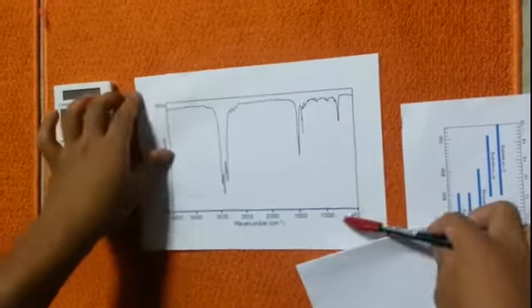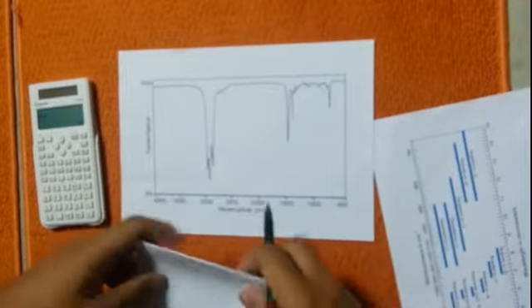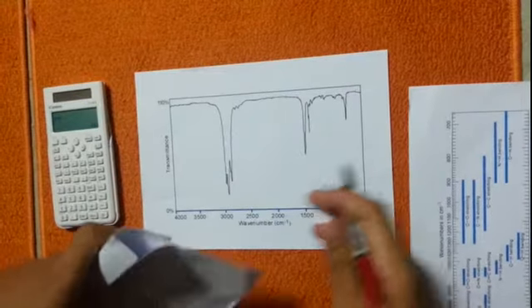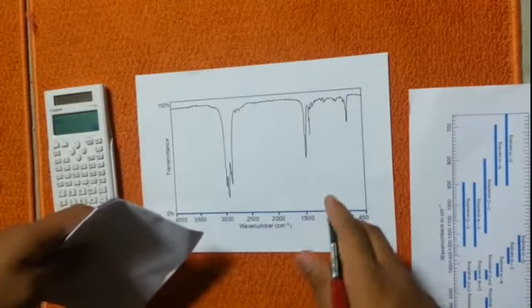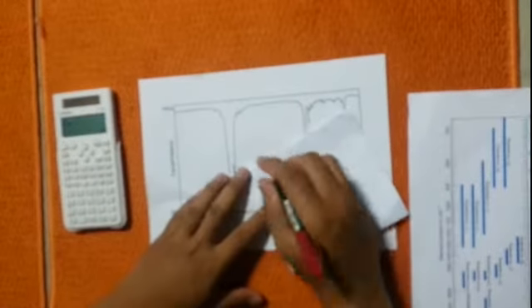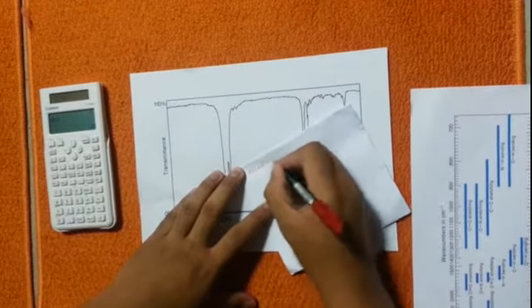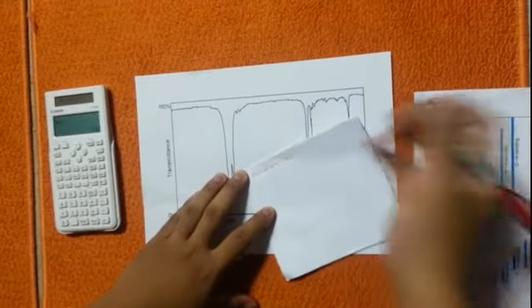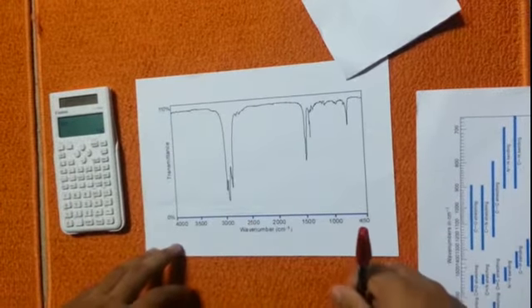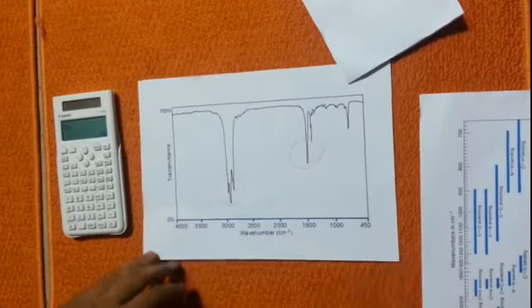So, basically this is a graph produced from an FTIR spectrometer. So, I'm going to explain to you how to get the molecular formula involved from the FTIR spectrometer. So, given molecular weight equal to 142, we will use the major peak involved here.